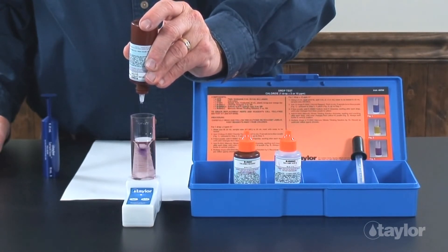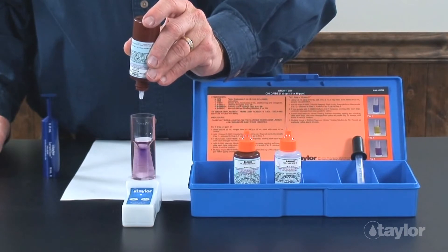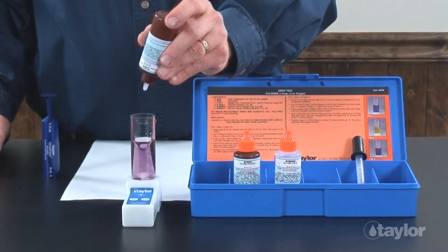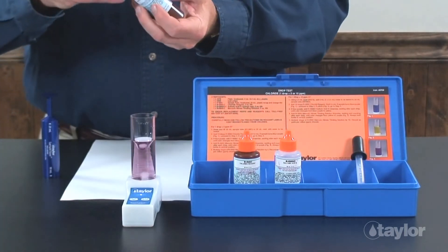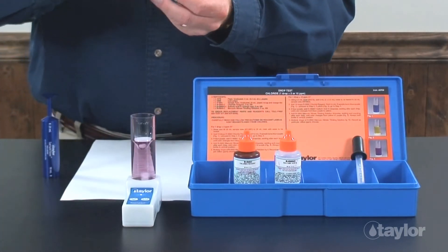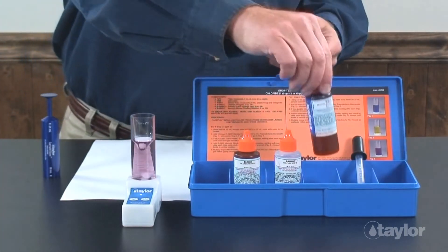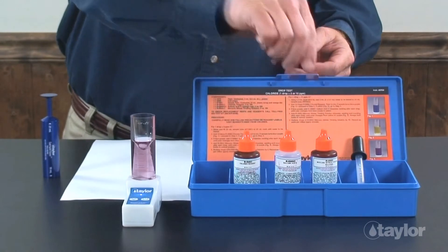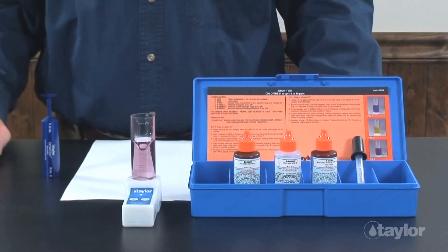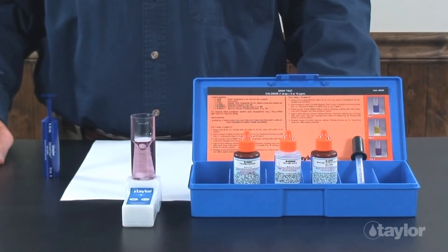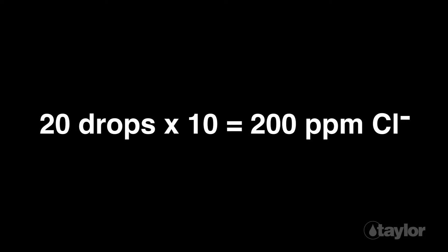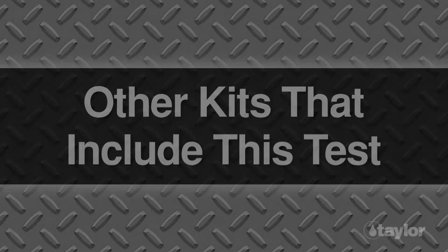Multiply the number of drops of mercuric nitrate titrating solution used by 10 and record as parts-per-million chloride. In this example, we used 20 drops, indicating a 200 parts-per-million concentration of chloride.